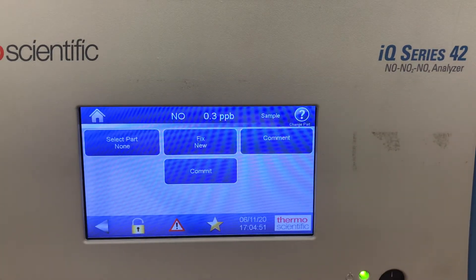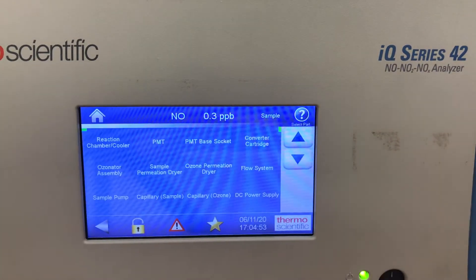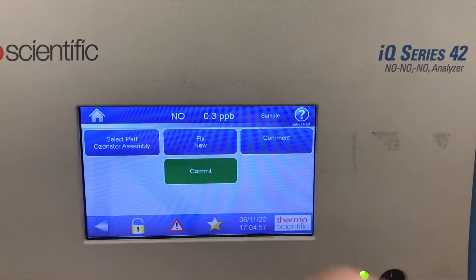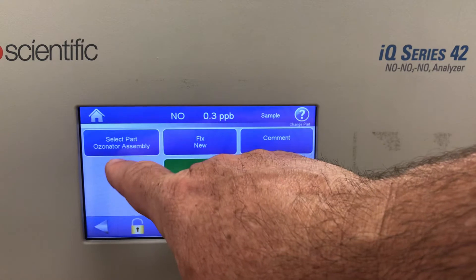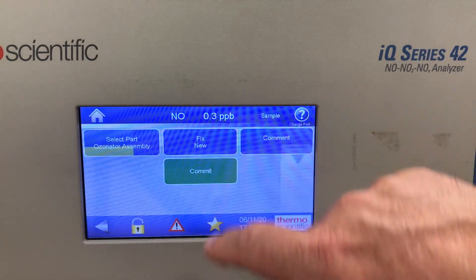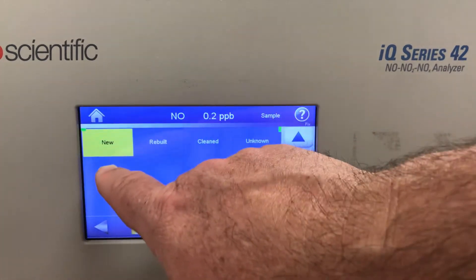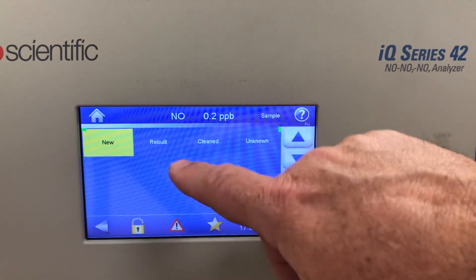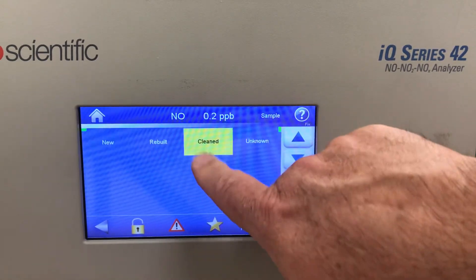I can go to Change Part, select the part I want to change — for example, the ozonator assembly. It asks whether I fixed the part: the options are new, rebuilt, cleaned, or unknown. I'll save and say I cleaned it.